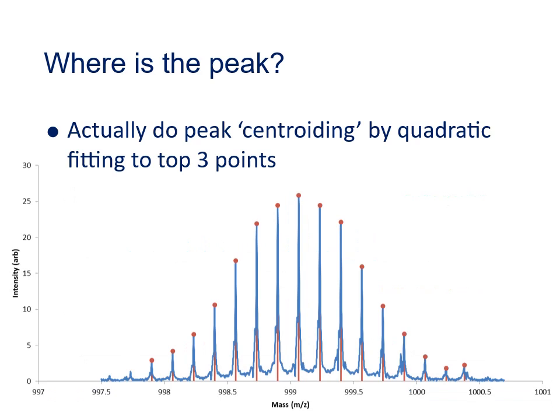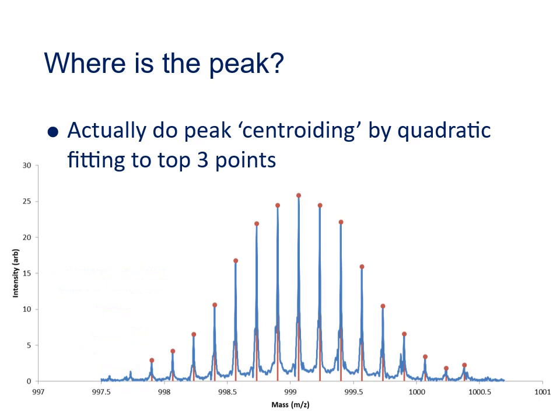I certainly never use centroided spectra unless I've also had a look at the profile spectrum as well. If I superimpose the centroided spectrum over the profile spectrum, we can see what's missing. Not all of the peaks are actually in the centroided spectrum. There are some that are quite clearly visible in the profile spectrum that are missing from the centroided spectrum. So why are these two peaks not included in the centroided spectrum? Quite simply, these two peaks were below a threshold that was set to determine which peaks should be included.